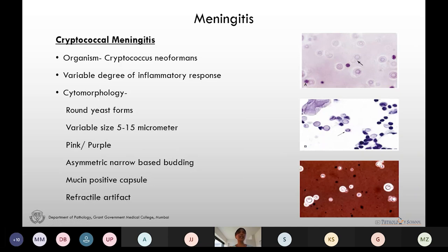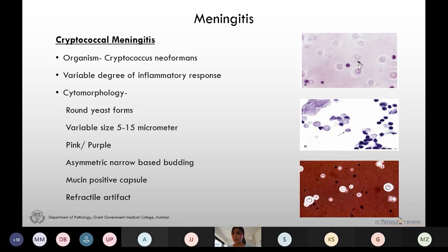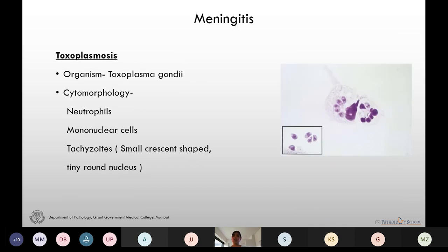Cryptococcal meningitis is caused by Cryptococcus neoformans and shows variable degree of inflammatory response. The Papanicolaou stain done for Cryptococcus shows the organism with a mucopolysaccharide capsule and thin-necked budding. It can also be cup-shaped, trapping air inside and showing a refractile artifact. This is the India ink preparation showing Cryptococcus neoformans. Toxoplasmosis is caused by Toxoplasma gondii; here we see numerous neutrophils and very small crescent-shaped tachyzoites with small round to oval nucleus.